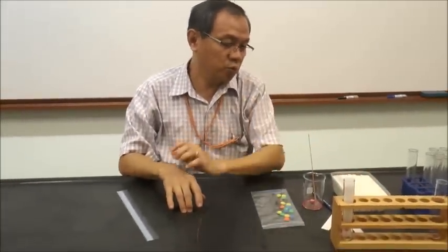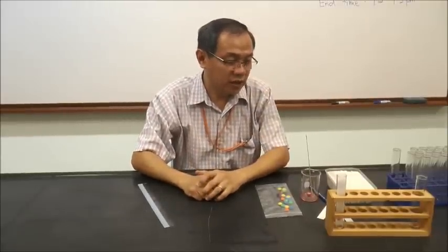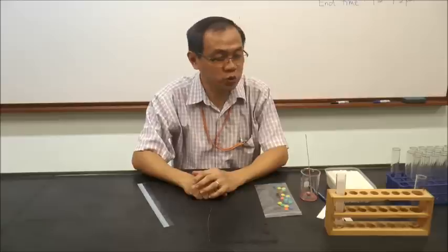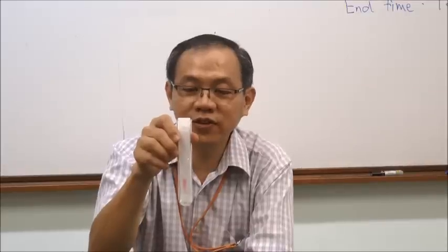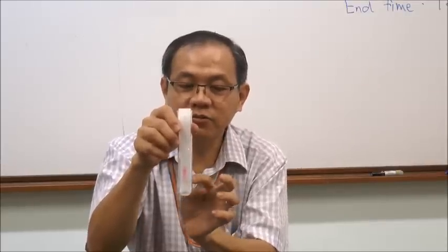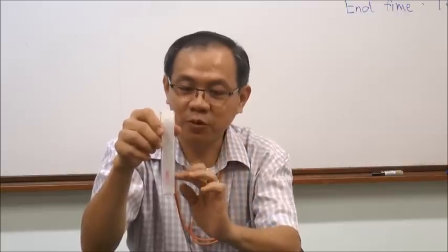When the water level rises, the colors will be separated and you will form your chromatogram in the end. I think it may take 15 minutes to even 1 hour. Okay, that's it. After a few minutes, you should see that the coloring will travel together with the water, and please be patient to wait for the entire color to move up to see what other color components will be revealed in this chromatogram.